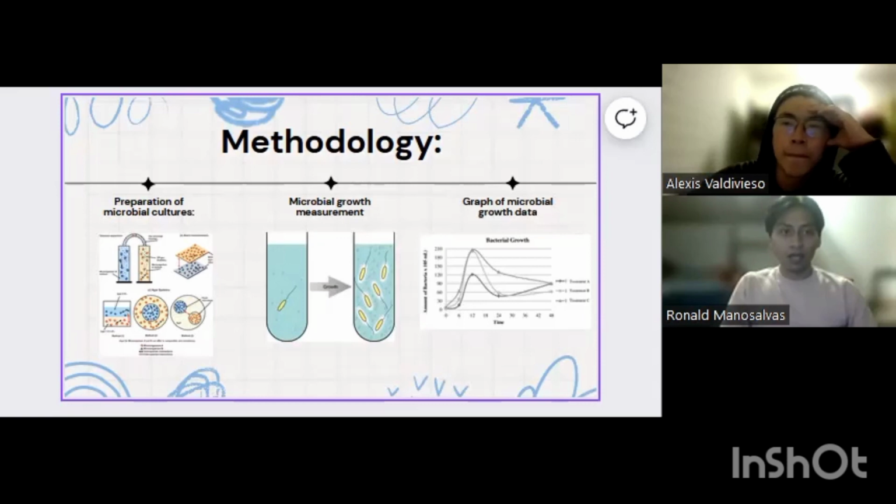Finally, calculating the G value. Once you have this calibration curve, you can use it to calculate the G value for E. coli samples when you have the measured absorbance. Simply plug the absorbance value into the calibration curve equation and so obtain the corresponding cell concentration.